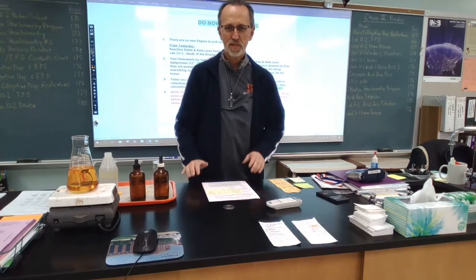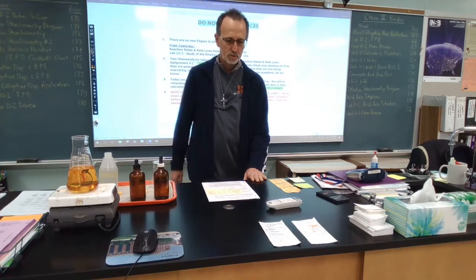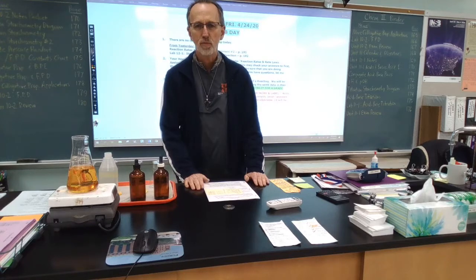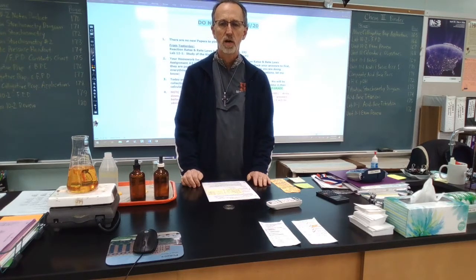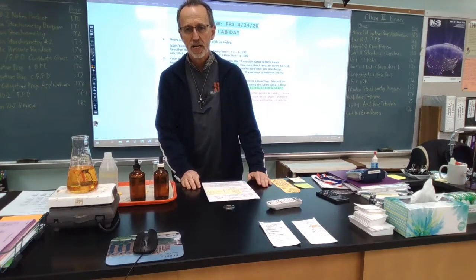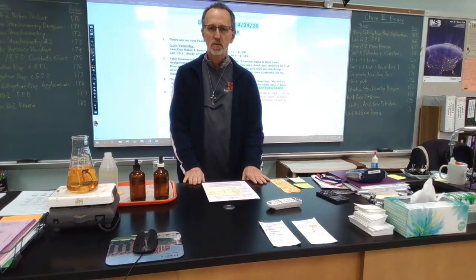Again, students, today we are going to do 12.1, which is to study kinetic reaction rates. We're in unit 12, studying kinetic reaction rates, reviewing the reaction and what this lab is about.